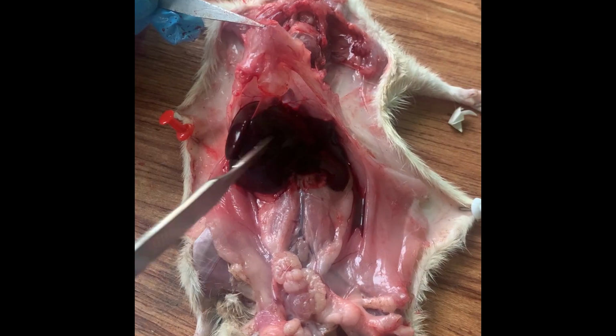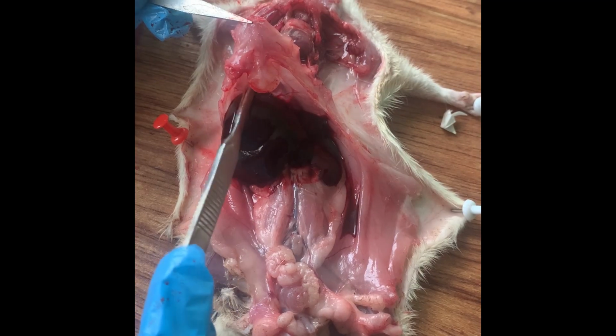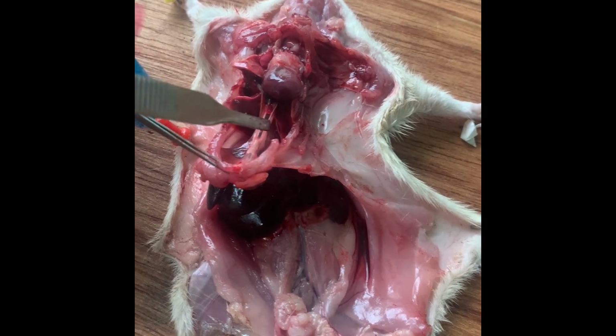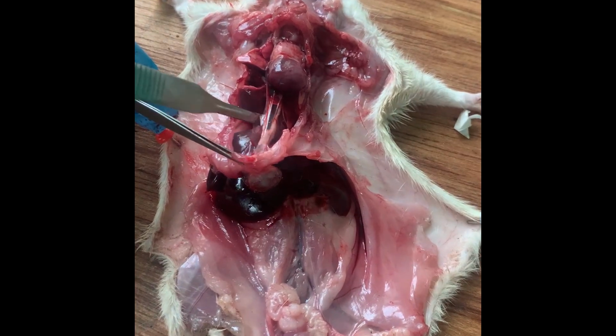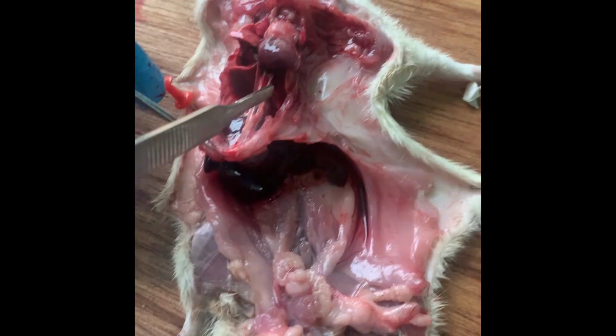If we open the thorax, you will see this, the thorax open. You will see a very nice thin sheet of diaphragm, translucent. That's the diaphragm in there. Here is a blood vessel. We'll talk about it. But this thick structure is the central tendon with cords from it.